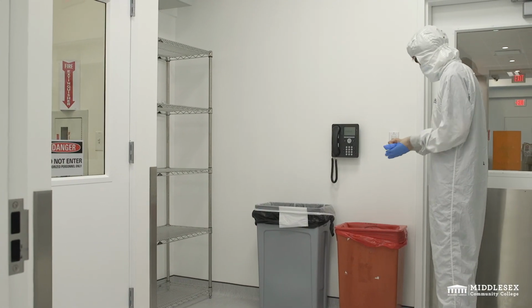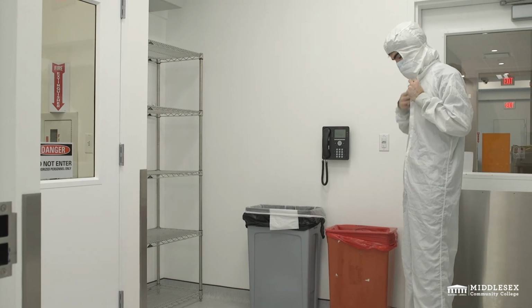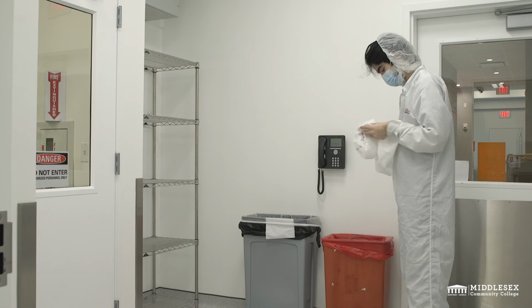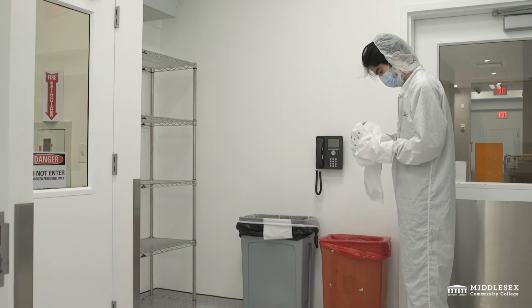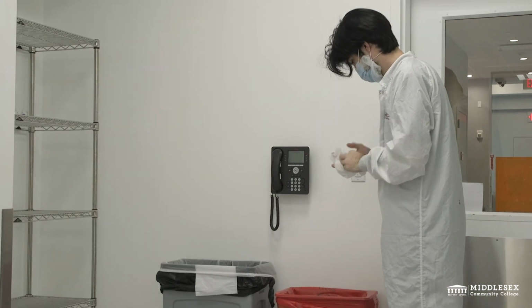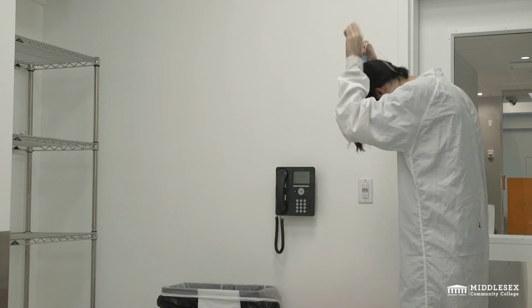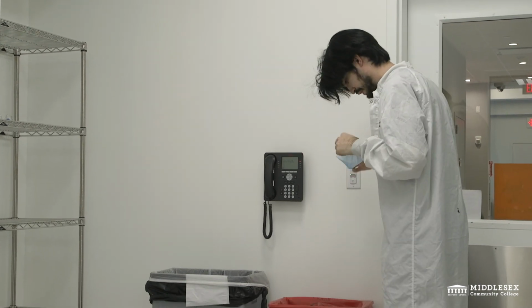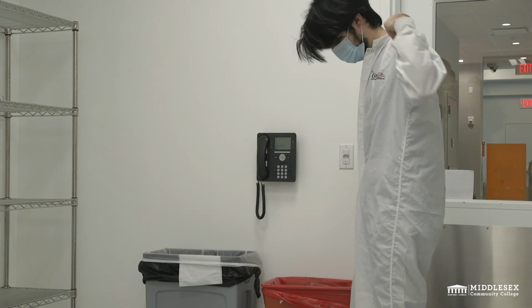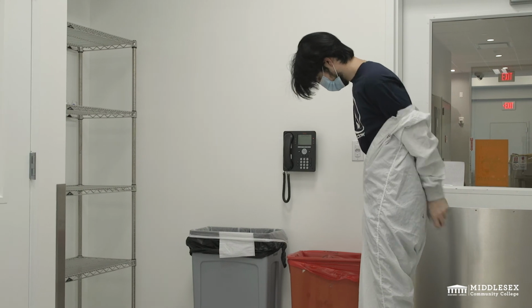Remove hairnet, beard cover, and gloves. Dispose in the designated red bin. Remove coverall or frock, as well as hood, and place in the appropriate bin.